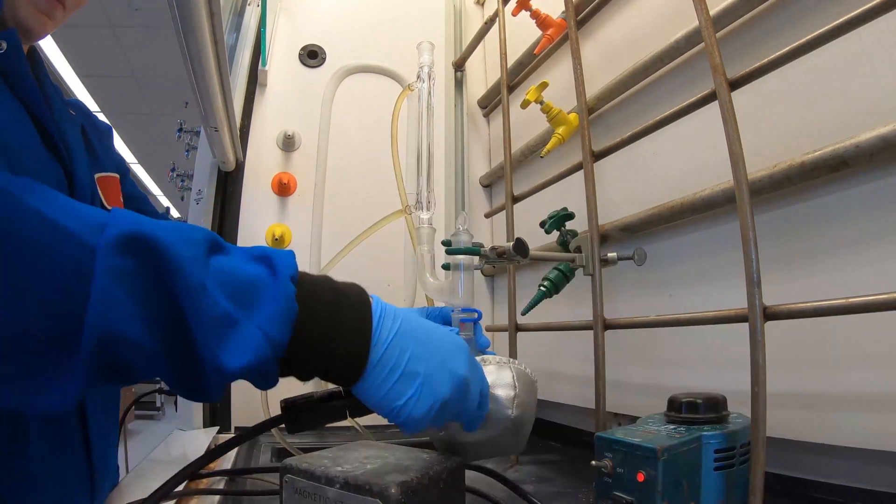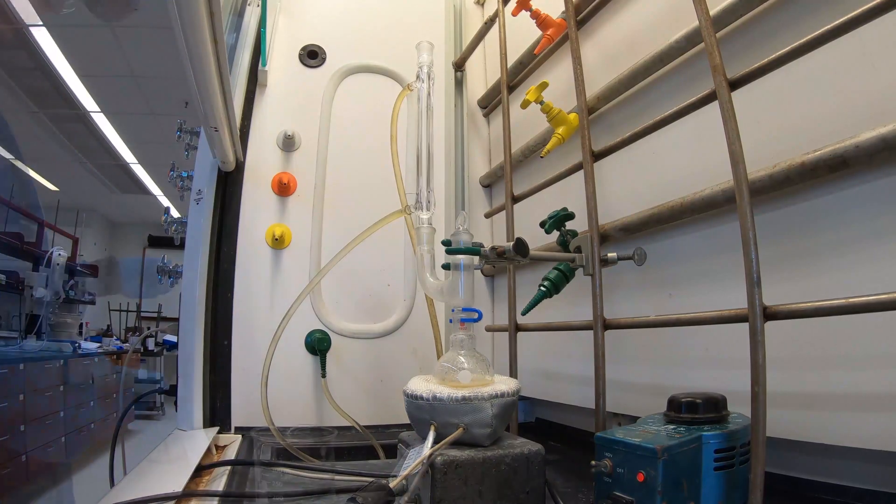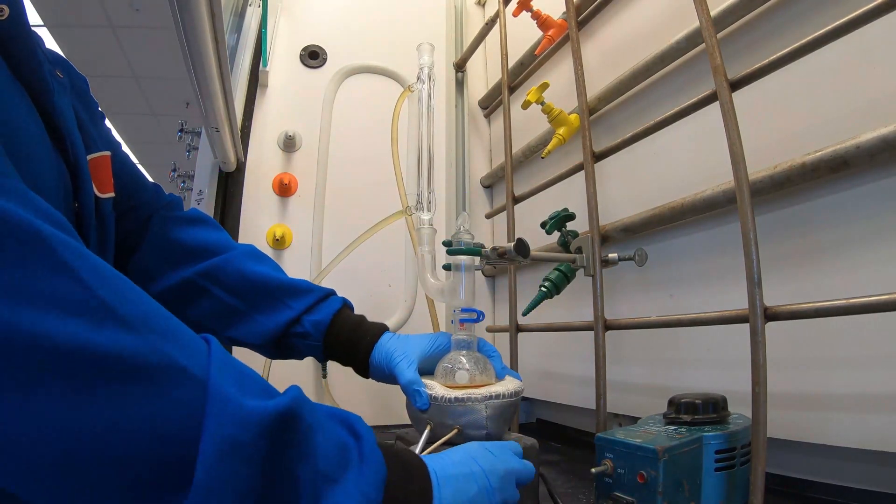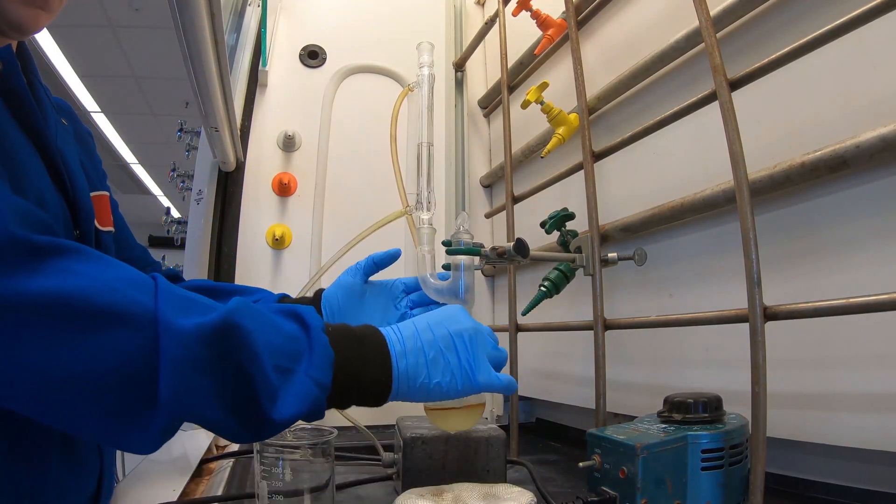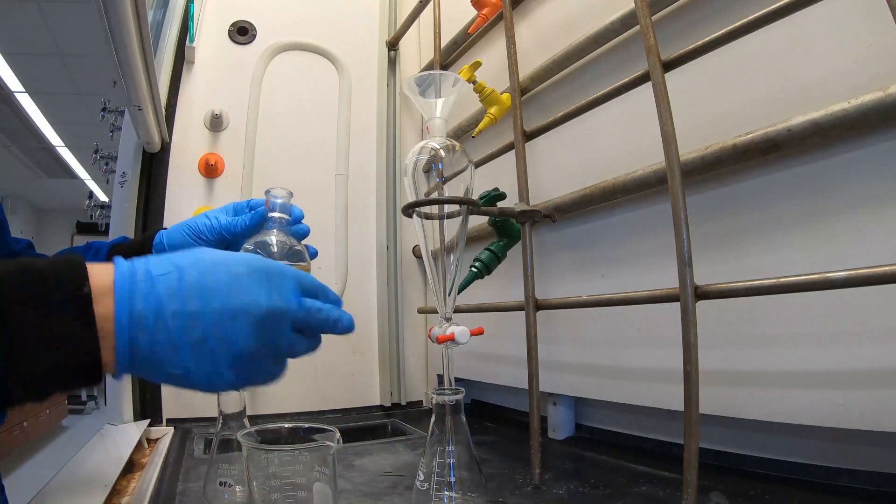Then you're going to heat your reaction for 15 minutes. Remove your round bottom flask from the heating mantle and allow to cool to room temperature. Then transfer the solution to your separatory funnel.